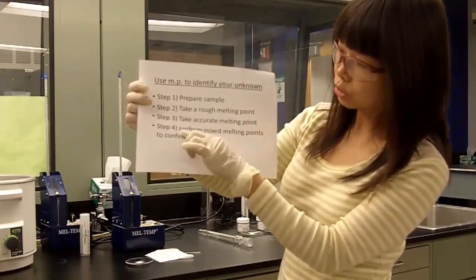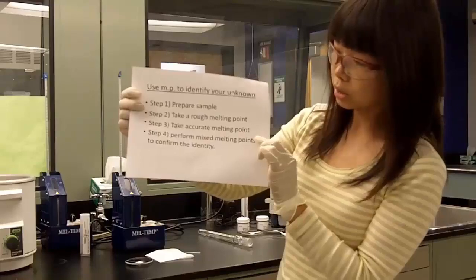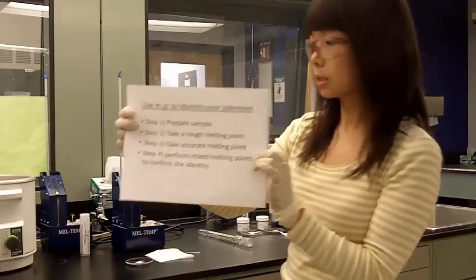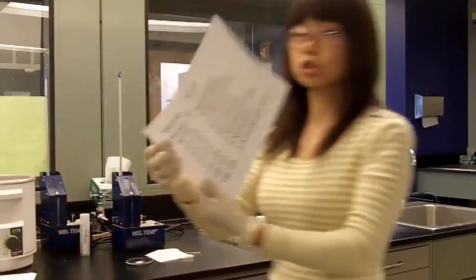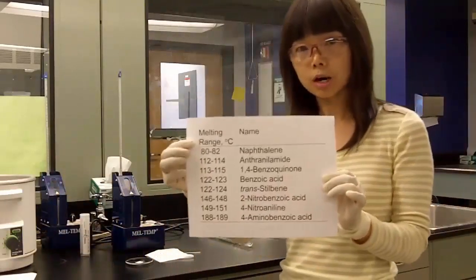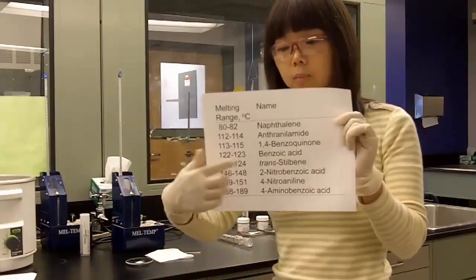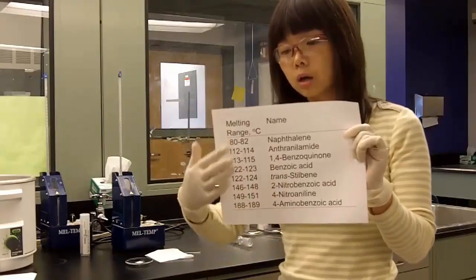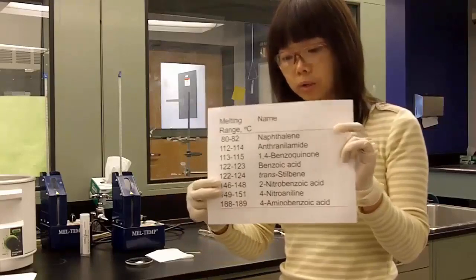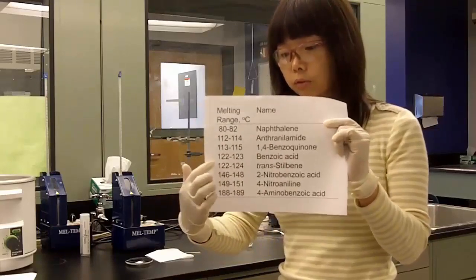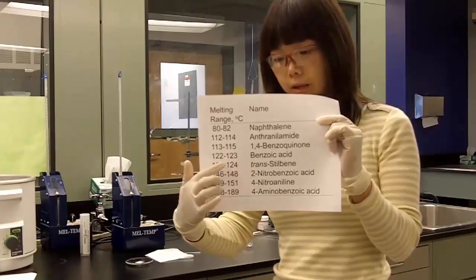And then you need to perform mixed melting point to confirm the identity. So you look at the melting point chart. From this chart you can see there are compounds' names and their melting points. And according to our melting point, our sample falls in this line or the next line.